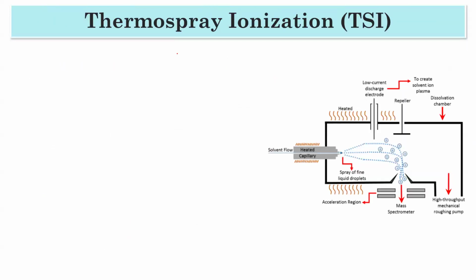There is another one, thermospray ionization, which is called TSI. It is similar to ESI, but in this case there is a solvent flow, and instead of having a charge, it has a heated capillary. Because of this heated capillary, it is called thermospray. Because of the heated capillary, your solvent will evaporate.